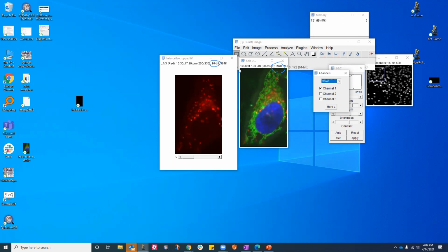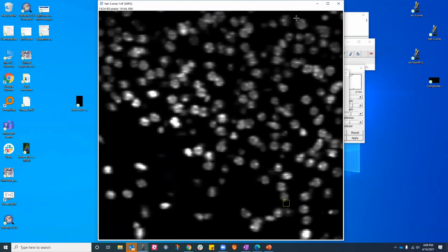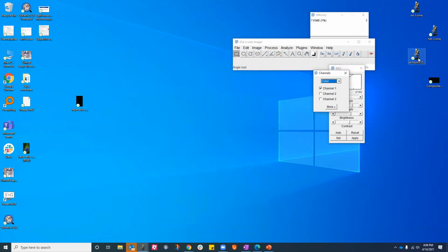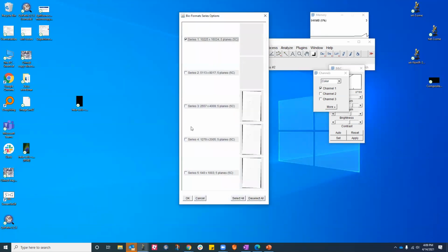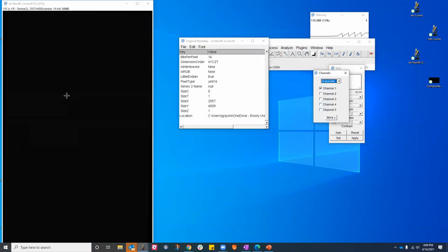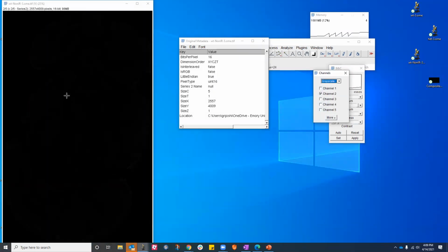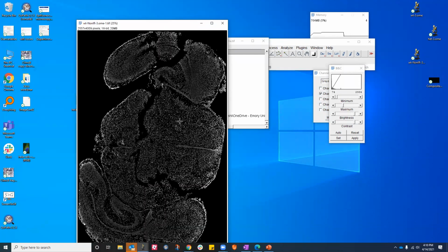One question that you asked was about replicating data, saving as ROI, which I really want to show to you. Yes, let me show that to you, because that is very important. So let's say I have a big image like this. Let me close that and open one of these images over here. Now let me duplicate and open the second one, which will be very easy to play with. All right, I have this.